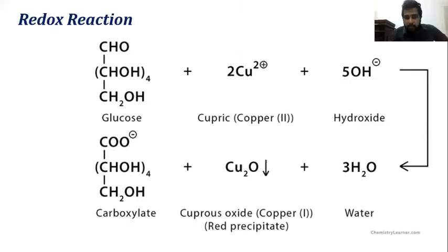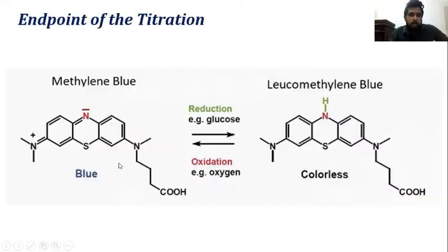You know this already. Okay, you have learned about this already. And what is happening in the endpoint is that methylene blue, which is in the blue color, will reduce into leucomethylene blue, that is colorless. Okay, that is a kind of reduction.